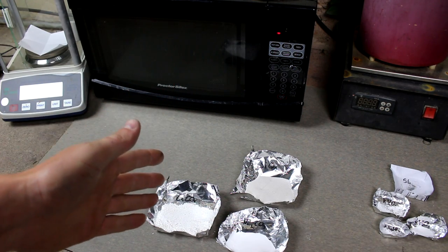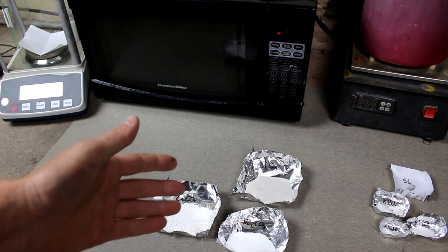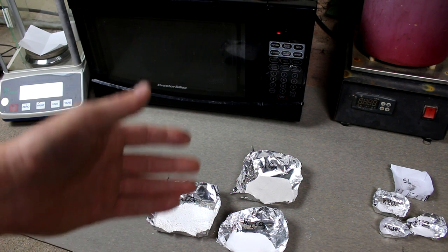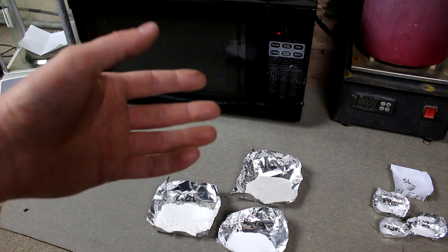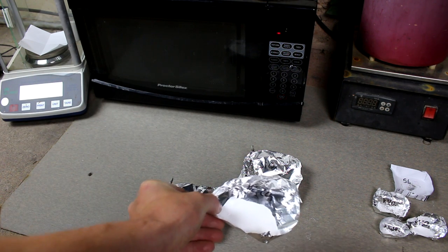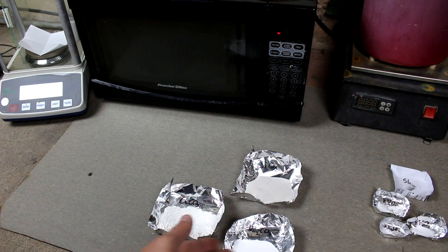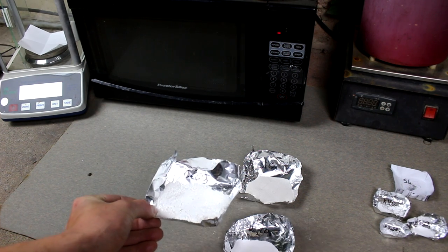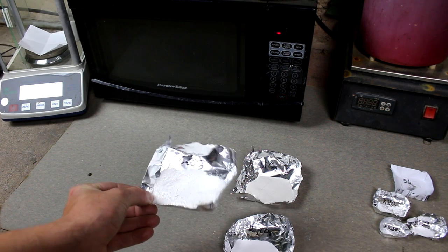So today I'm going to be making some soda lime glass, which is of course the most common glass that you'd encounter in everyday life in things such as window panes and glass bottles. It is called soda lime glass because two of the main ingredients are sodium carbonate, or soda ash, and calcium carbonate, which when you heat it, it forms lime.